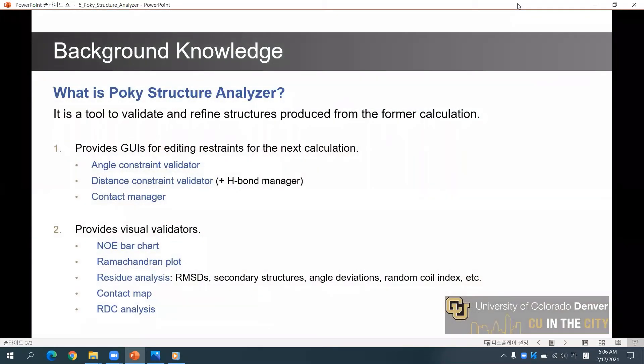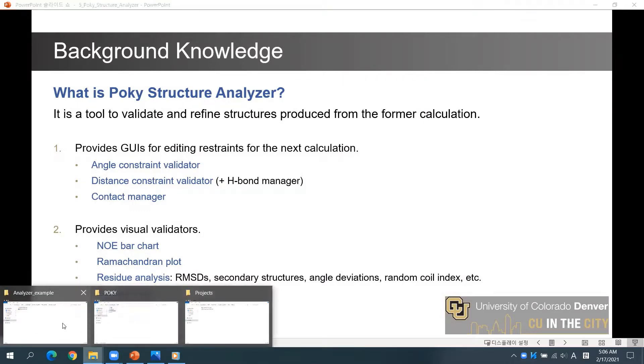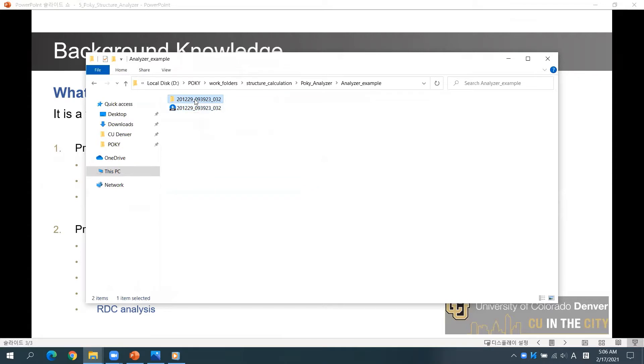Poky Analyzer is a tool to validate and refine structures. It provides graphical user interfaces for editing restraints and visual validators for various features. Before opening the Poky Structure Analyzer, you should first download a job result from your email inbox and unzip the result.